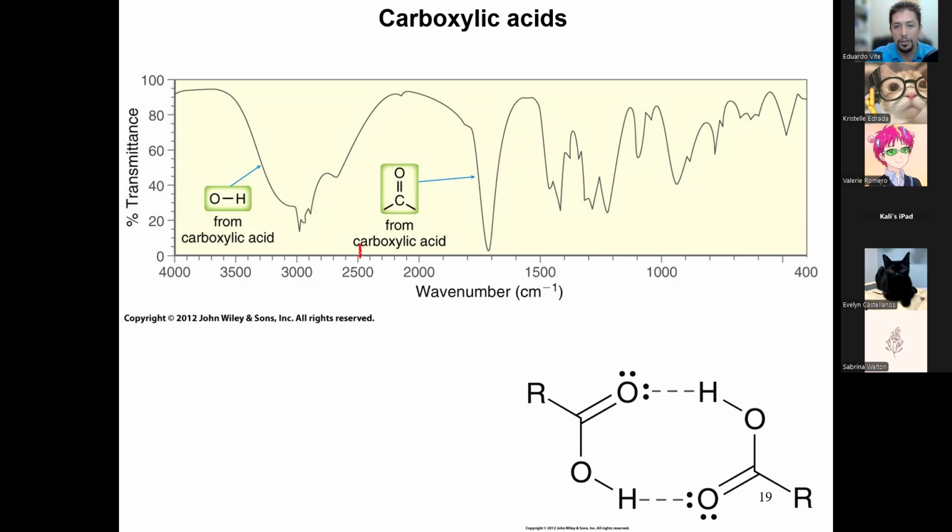It starts at around 2500 right here. You see, you get this really wide signal all the way to 3500. It goes very, very broad. Usually there's a 1000 wave number spread when you have a hydroxyl, this is the OH, a hydroxyl of a carboxylic acid. And also, you'll notice, what is this really sharp bottom peak at around 3000? What are those?